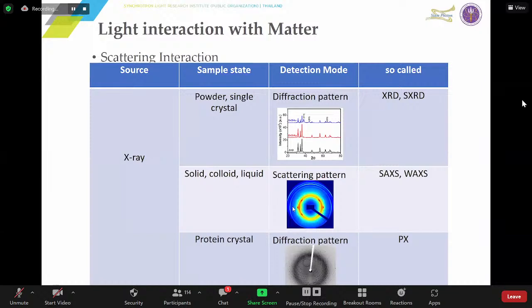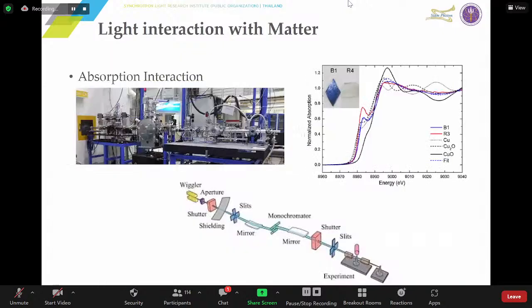And if you interpret the asymmetric pattern, you can get bigger structures, more than the atomic structures of the XRD. You get into the range of hundreds of nanometers until the sub-micron scale by interpreting these asymmetric patterns. And also for diffraction patterns, you have the technique of protein crystallography that we have. I'm going to skip this technique today because we want to talk about the materials.